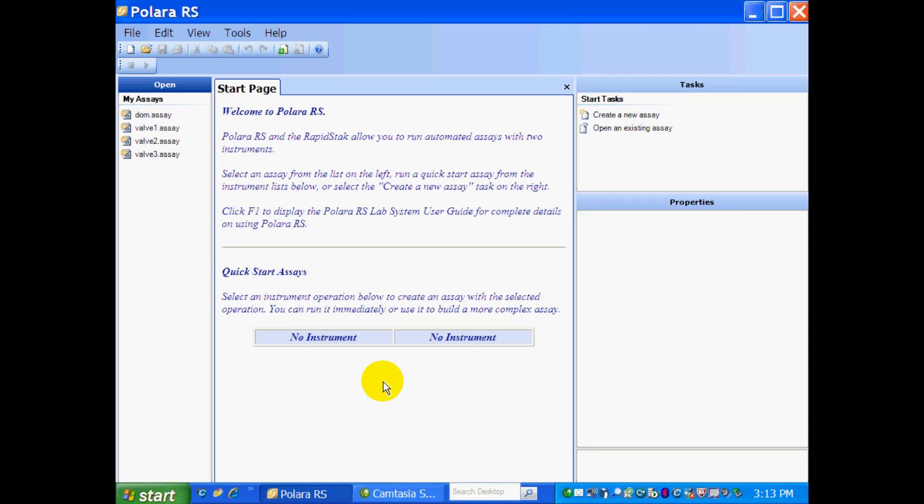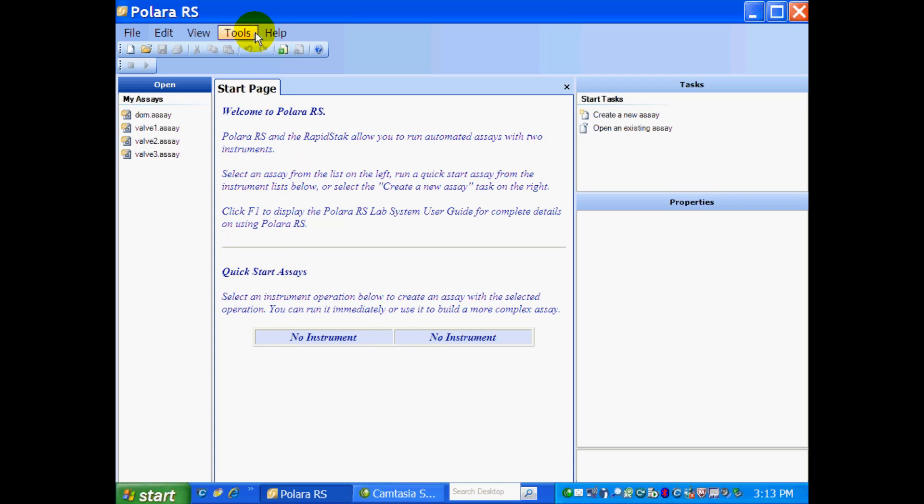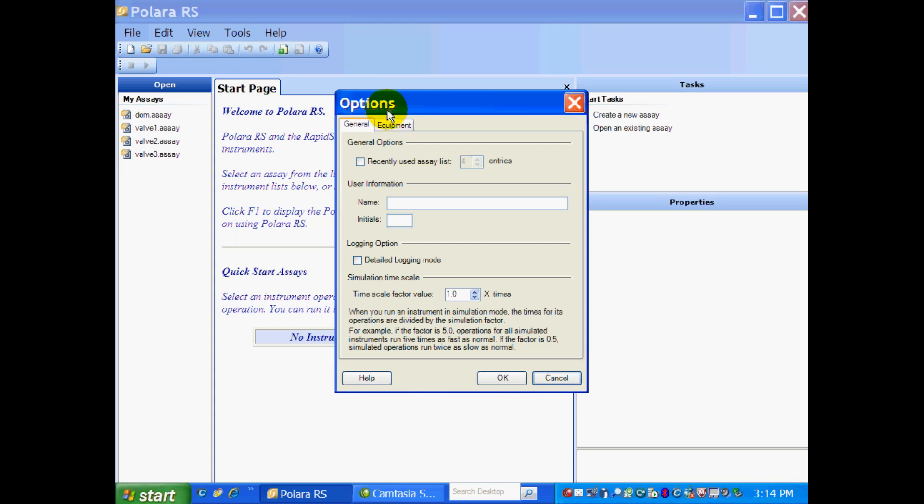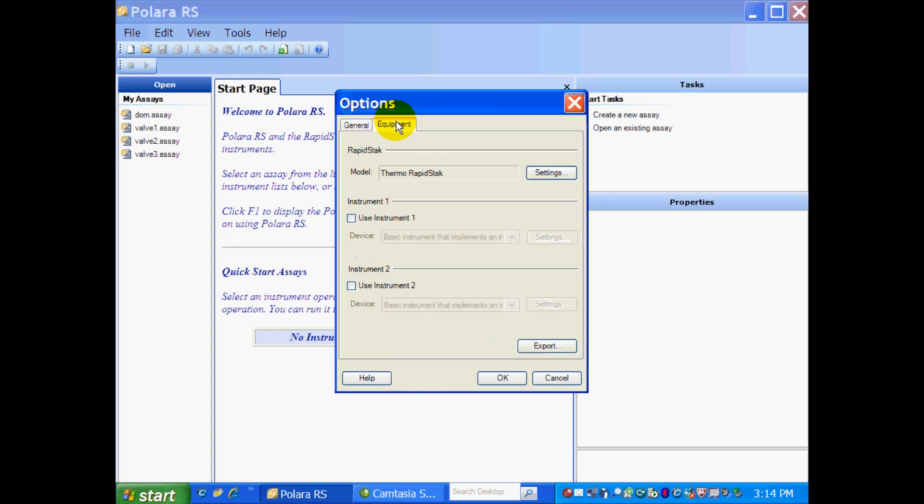Here we are in the Polara RS setup page. The first thing we need to do is add our instruments to our system. As you can see, we have no instruments on either side of the RapidStack. To do this, we're going to go to Tools, Options, and the Equipment tab comes up.